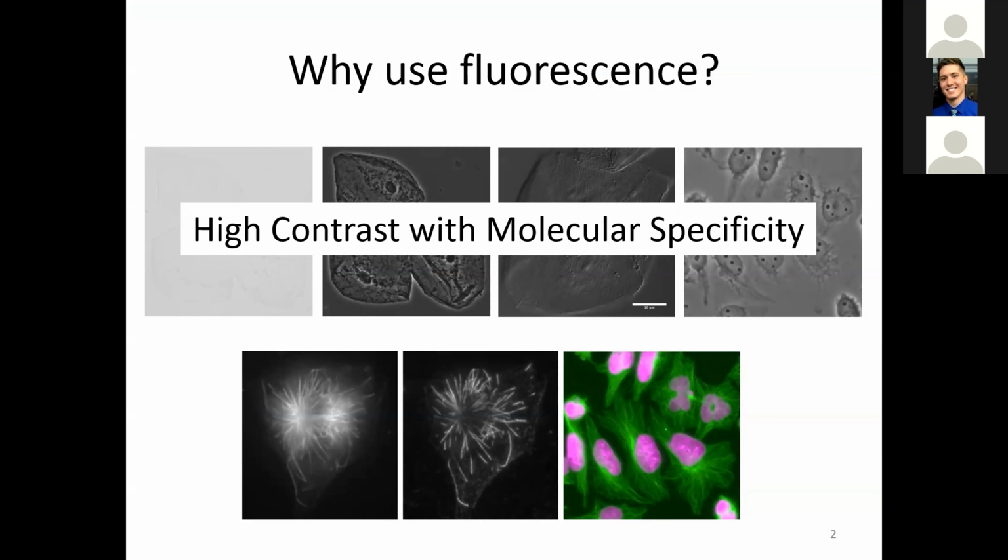And so we can tag a particular molecule or protein or structure with a fluorescent molecule or dye of our choosing to then differentiate two different structures from one another. And this is of course a very powerful tool that has been developed over the years. It's why Chris and I have jobs currently. But there are some caveats to really collecting our fluorescence in a very careful way.